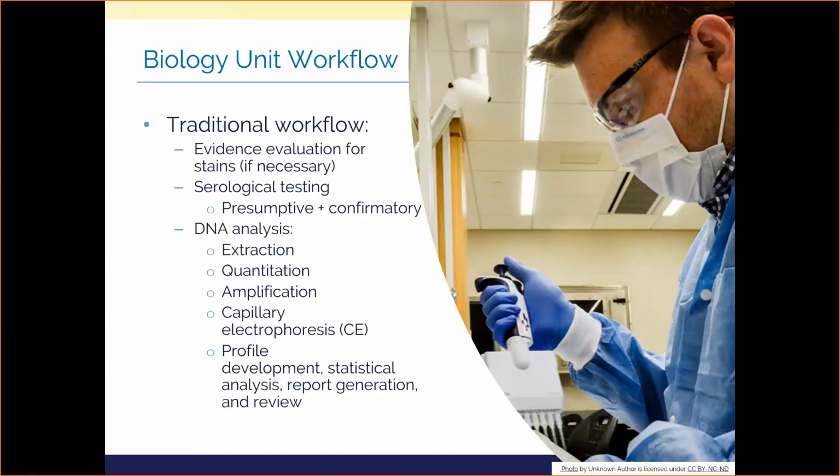Let's go ahead then and discuss the basic day-to-day in a forensic biology unit. Typically evidence involving the letting of biological stains requires serological testing of any suspect spot to determine if it is relevant to your case or not. After all, we wouldn't want to try and process a ketchup stain for DNA and waste valuable taxpayer dollars on false leads. To that end, I want to emphasize the importance of discretion in a lab analyst's work, especially right here at the beginning of the lifespan of an item of evidence in the lab.